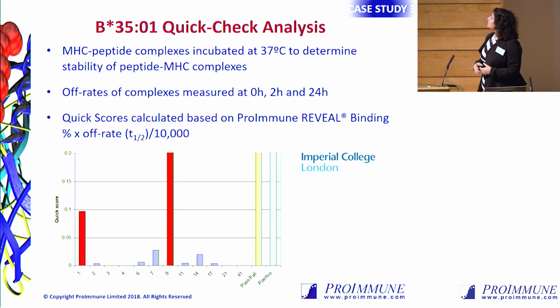And that also confirms how well the peptide binds and how likely of an epitope it is. So thanks to this HLA binding assay, we managed to synthesize class 1 pentamers, and that's how they managed to monitor the responses to the virus by looking at the MHC class 1 responses.